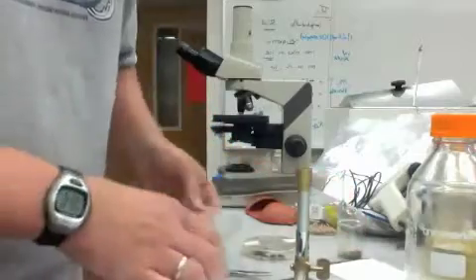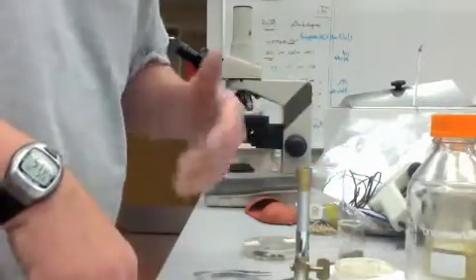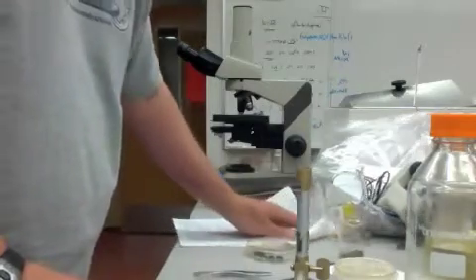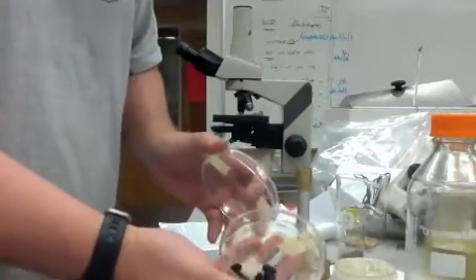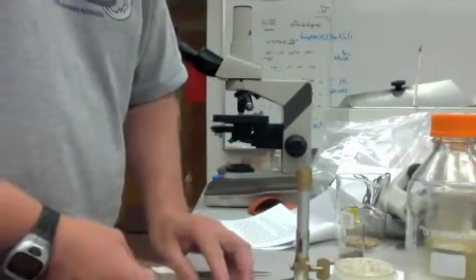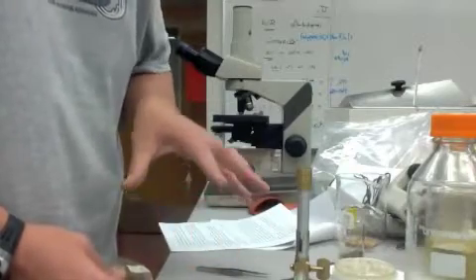The other isolation that's a little different is the Myxobacteria. Now, one, you're just going to pepper soil onto the surface of a nutrient broth agar plate, but the other, you use this baiting procedure with dung. So here is some deer pellets that have been autoclaved. You could touch these, you probably eat these and they wouldn't be a problem. And here is a plate that is poured with some water agar. It's still liquid, which is important, so I use sterile technique to do this.